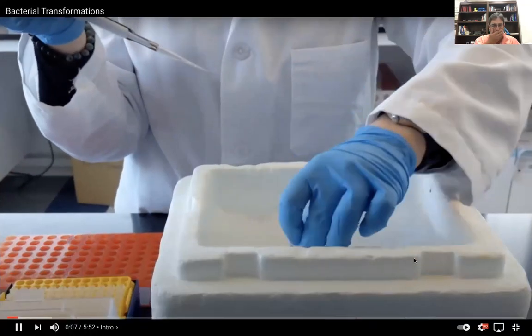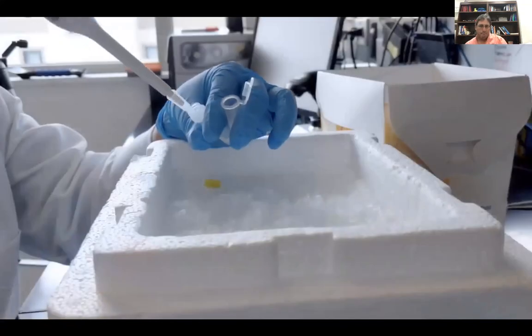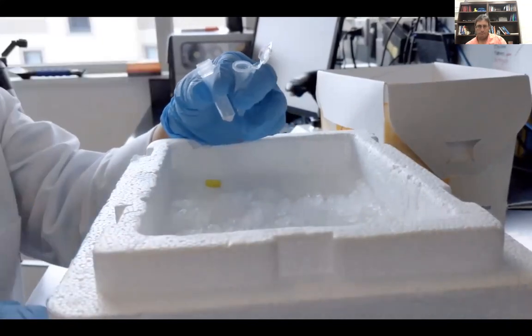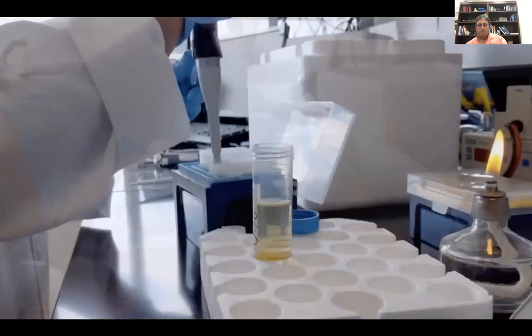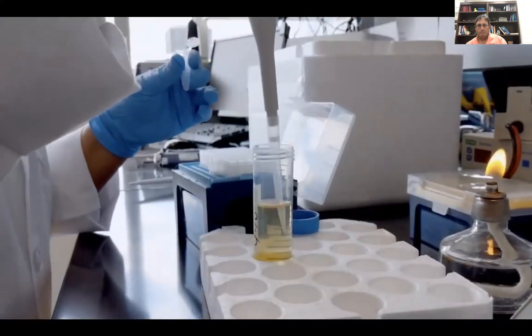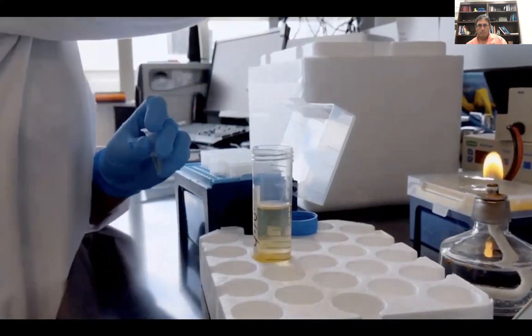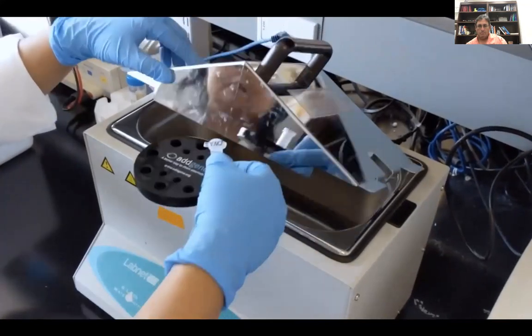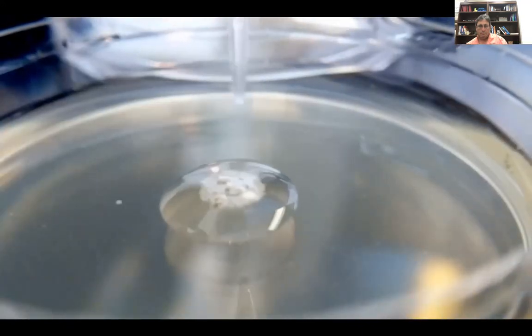Transformation is the process by which foreign DNA is introduced into bacterial cells. Plasmid transformation is an important technique for microbiology experiments because it allows plasmids to be stored and replicated in bacteria. Scientists use genetic modifications and chemical treatments to create bacterial cells that are easy to transform. These are known as competent cells. In this video, we will show you how to use a standard transformation protocol to introduce plasmid DNA into competent cells in order to store and replicate your plasmid of interest.